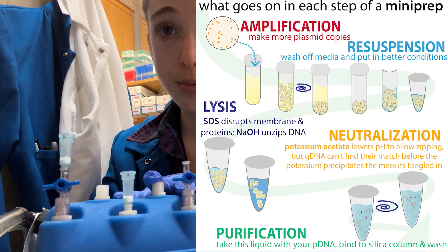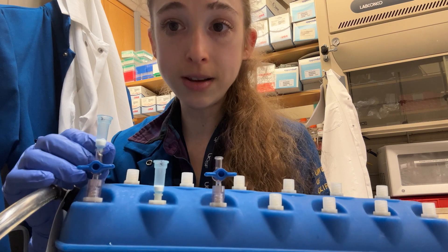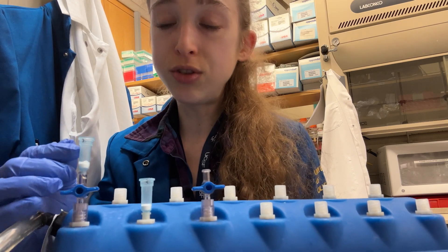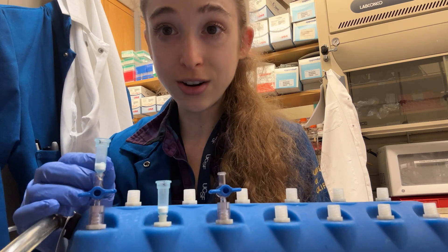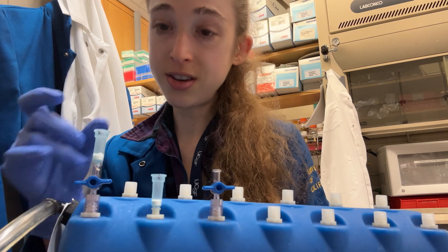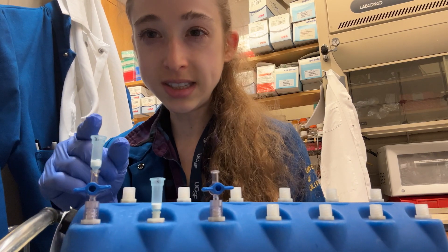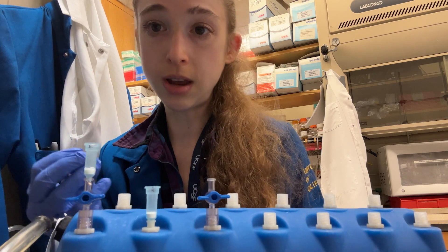These vacuum manifolds are really helpful for mini preps. They're also helpful if you're doing a purification where you're trying to combine multiple samples onto a single column, which involves a larger volume — you can only load about 800 microliters at a time, but if you have multiple cell pellets and want to combine plasmids for a high concentration or high yield, you can load the same column multiple times without going back and forth to the centrifuge. I've also used it for RNA extractions with the DirectZol kit — going from TRIzol to a column, and if you have a large volume you can keep loading it over and over to get it all concentrated, then wash and elute.